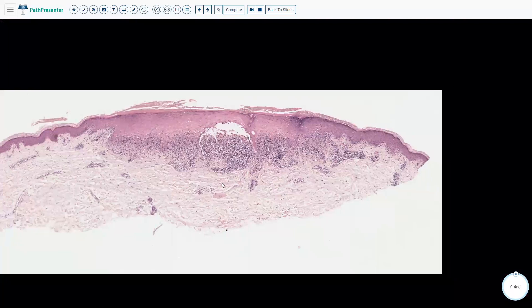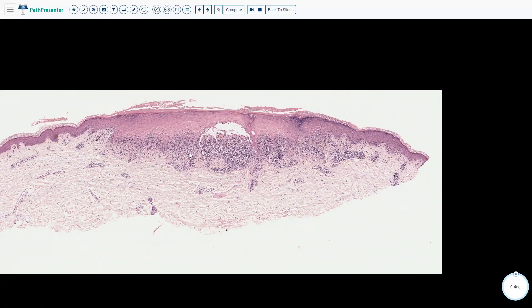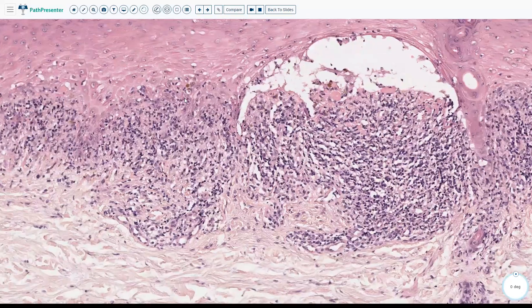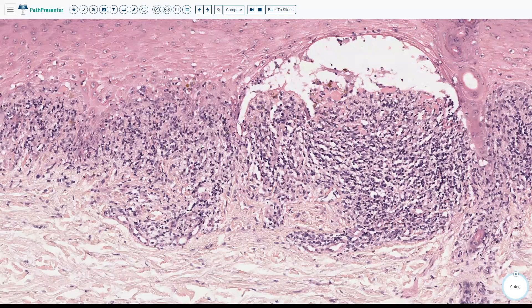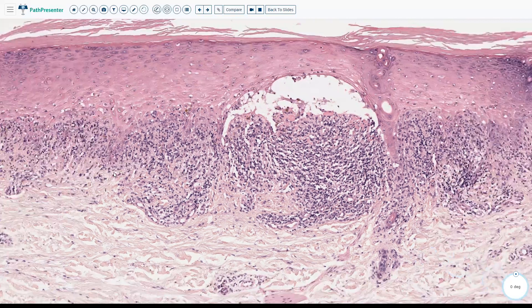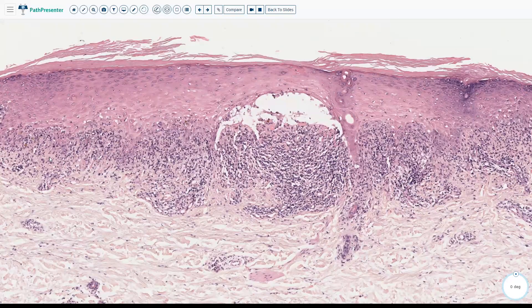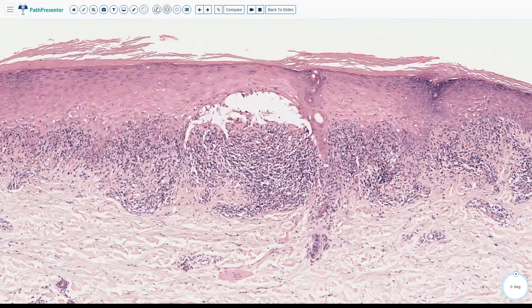Usually the lower part of the dermis is pretty clean, which is very classic for lichen planus. To summarize the histological features: compact hyperkeratosis, no parakeratosis, wedge-shaped hypergranulosis, a dense lymphocytic infiltrate hugging the dermal-epidermal junction, admixed apoptotic keratinocytes, pigment incontinence, and usually no eosinophils. You always have to go to high power and scan the dermal-epidermal junction very carefully to check for eosinophils. Usually in lichen planus you are not supposed to see any eosinophils, though sometimes it may happen.